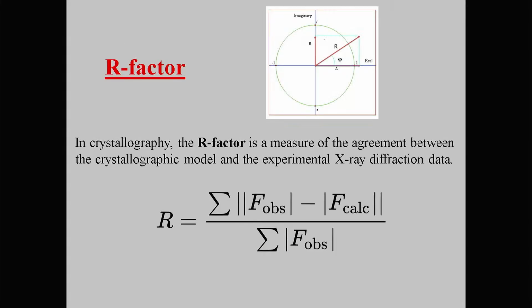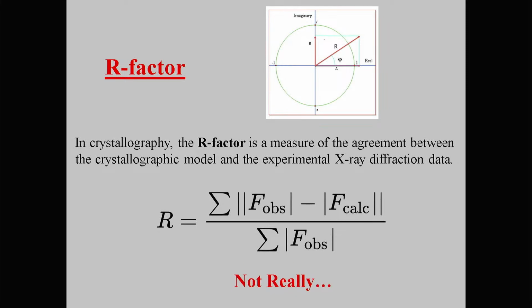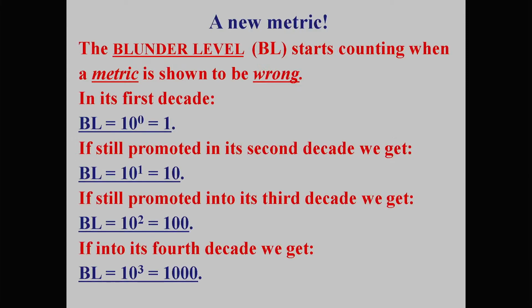And the R factor is actually a bad normalization here, because it's normalized only to the F observed and not to the F calculated. So there's some hidden normalization in the program that will make this thing behave, because you can multiply a 3D map by a constant. It doesn't matter. It doesn't change anything. But the R factor changes. So, okay, I'll stop with this slide.